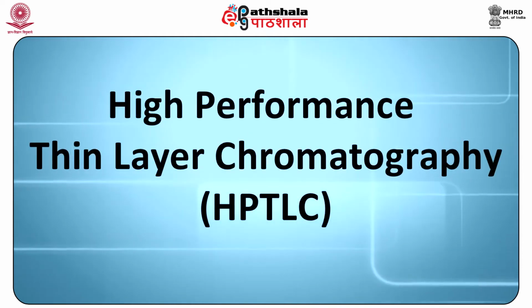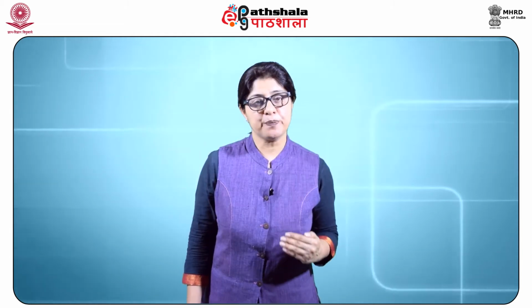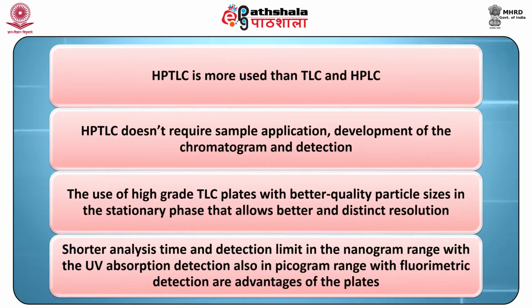High performance thin layer chromatography, also termed as HPTLC. HPTLC is an organized and automatic form of thin layer chromatography with improved and unconventional separation and detection parameters. It is also known as high pressure thin layer chromatography, planar chromatography or flat bed chromatography. Nowadays, HPTLC is more used than TLC and HPLC because HPTLC does not require manual sample application, development of the chromatogram and detection and so on.